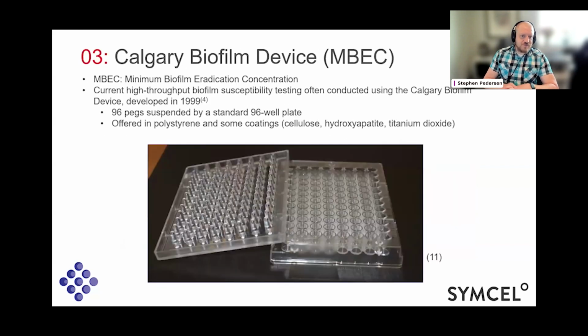Introduction to the Calgary biofilm device. This is kind of the standard biofilm assay right now for antimicrobials testing. A lot of you probably know it as the MBEC, minimum biofilm eradication concentration. It was developed in 1999.